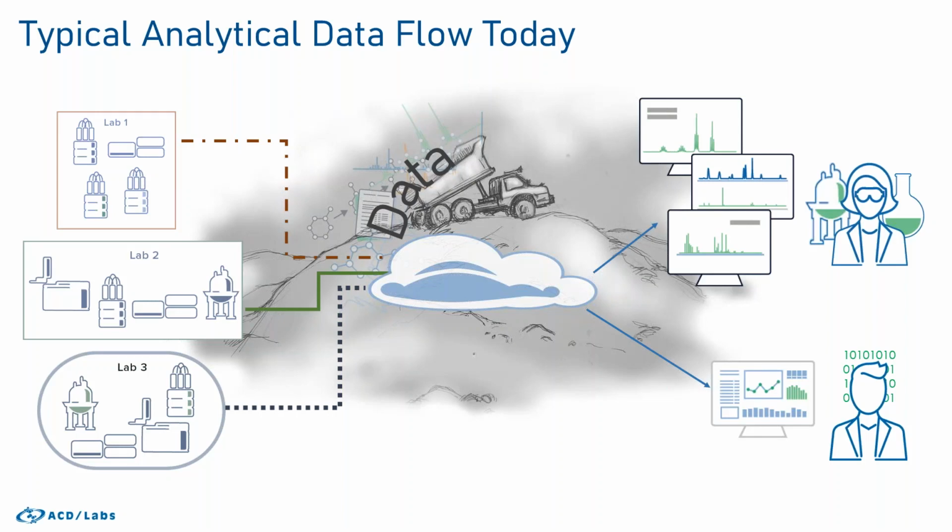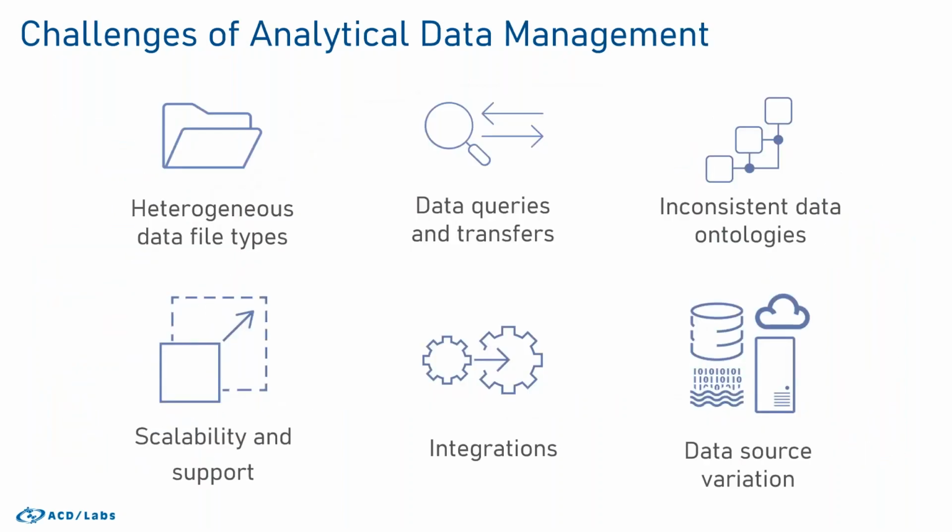Certainly, there are a number of challenges to making this more efficient as you create an analytical data management system. Some of these challenges are pretty obvious. We have heterogeneous data file types. Every vendor will have their own proprietary data format and their own systems. There are initiatives in place trying to standardize the analytical data formats, but they haven't yet gotten to the point where the specifications have been ratified, so it's not fully adopted by the vendors.